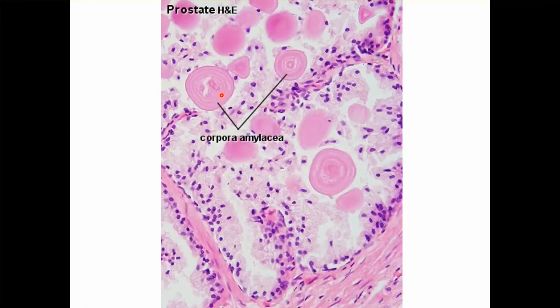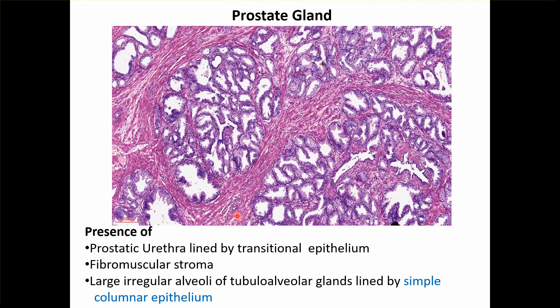Coming to prostate. The prostate is made up of fibromuscular stroma and glandular stroma. Inside the prostate you can see concretions called corpora amylacia. In some slides you can also see the prostatic urethra cutting through, which is lined with transitional epithelium. The white spaces are the glands — large irregular tubular alveolar glands lined with simple columnar epithelium.